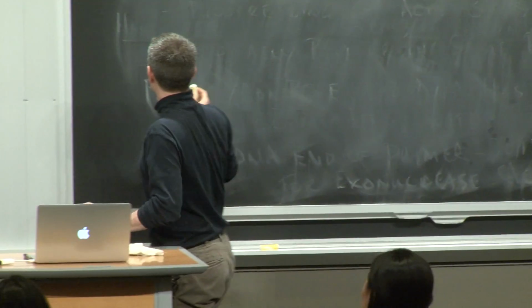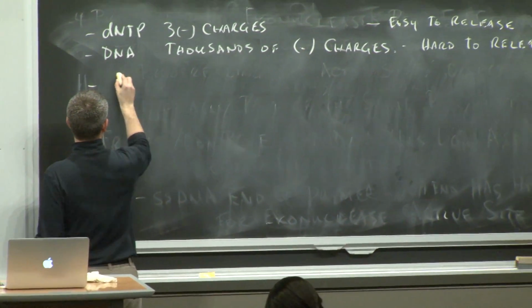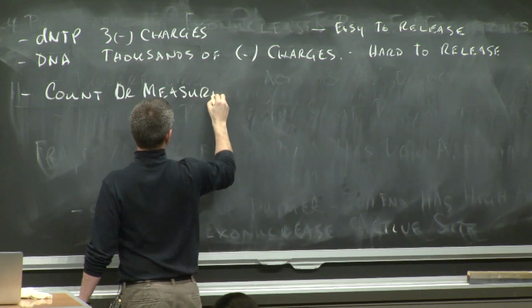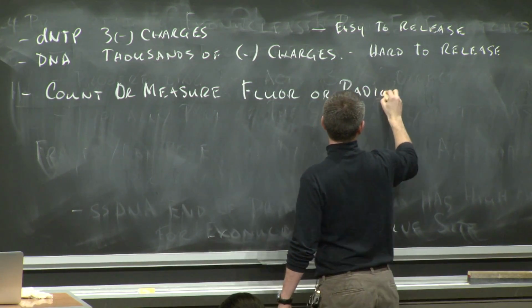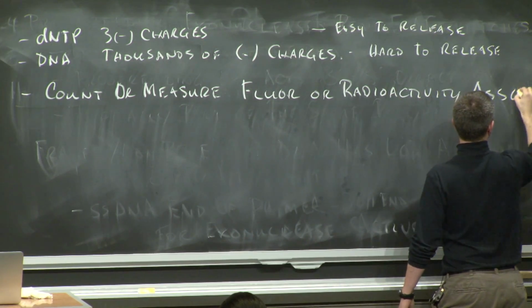So what do you do with it at this point? You basically take this material and you count or measure the fluorescence or radioactivity associated.